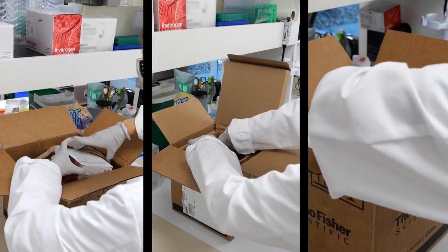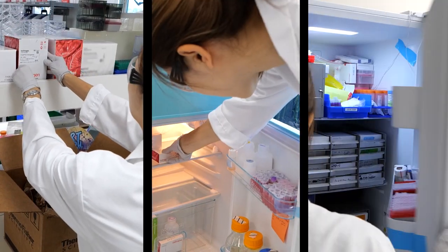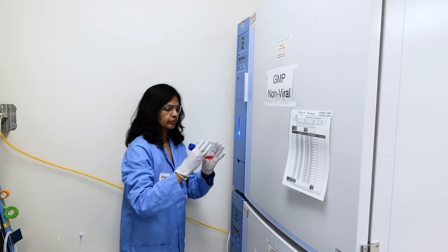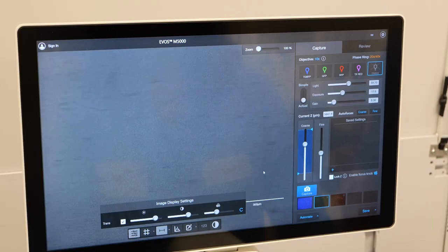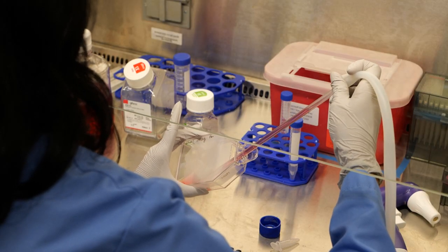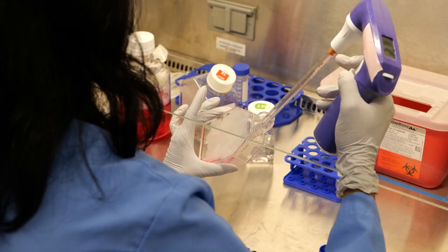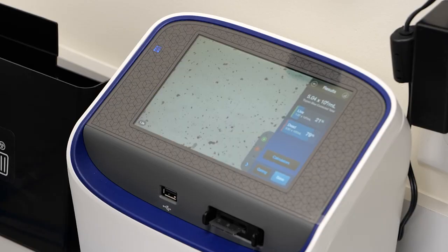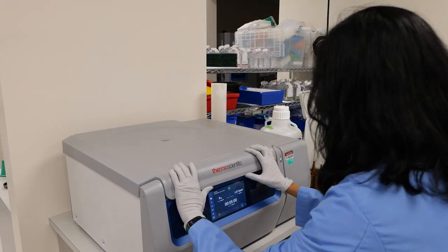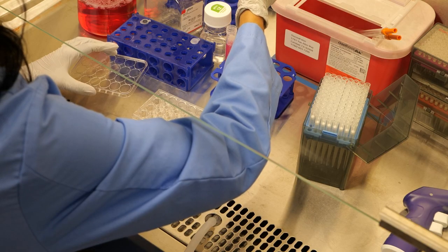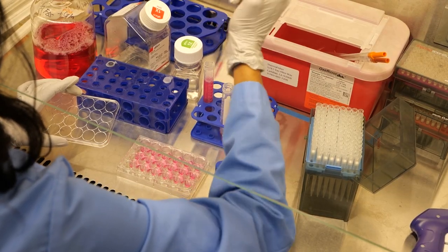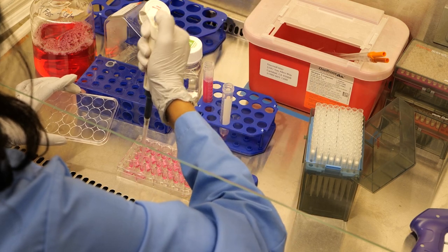Once your reagents arrive in the lab, unbox them immediately and store them according to the package labelling. To start your knockout experiment, cells must be properly cultured, counted, and seeded to ensure a consistent and healthy cell population is ready for transfection. Plate your cells so they are approximately 30–70% confluent on the day of transfection, with three replicate wells for each control and gRNA. For this experiment, we will use a 24-well plate, plating 40,000 to 90,000 cells per well in 0.5 mL complete medium.